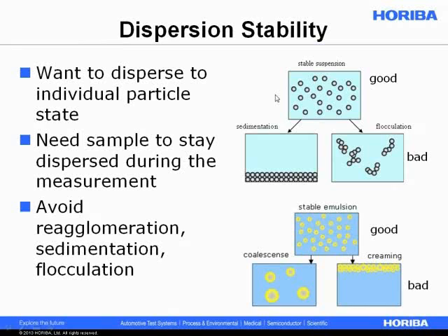We want to have a stable dispersion, certainly in our instrument. While we're taking the measurements, we don't want things going on with the particles during the measurement.